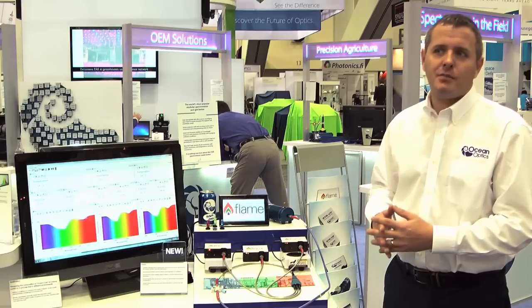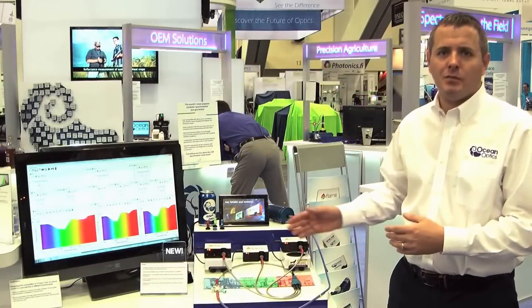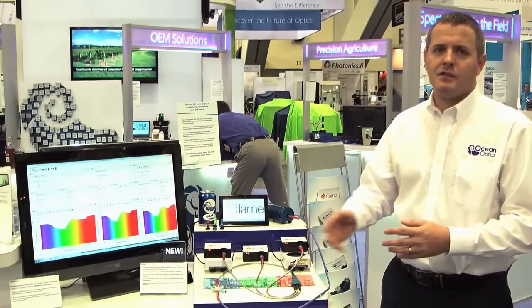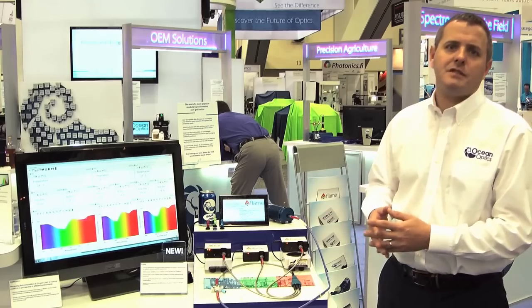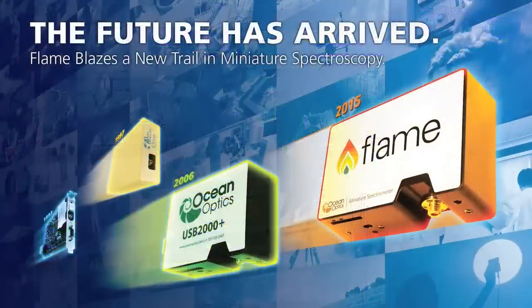Also incorporated into this product are some novel features of interchangeable slits, allowing you greater flexibility coupled to that reduced variability, meaning that whether you're an academic, an industrial customer, or an OEM customer, you're going to benefit in the same way that our customers have benefited from miniature spectroscopy for the last 25 years. By listening to you and listening to your needs, we're proud to present the new Ocean Optics Flame Spectrometer.